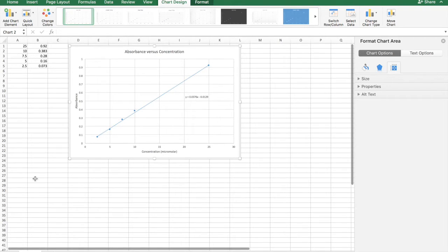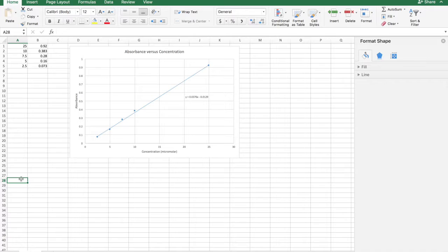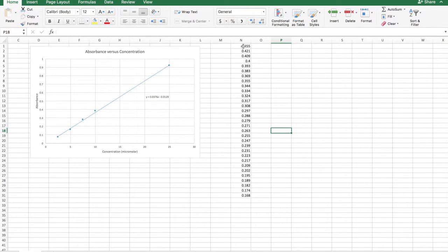All right, at this point in the lab, you then created your reaction. You added 4 mLs of your crystal violet solution and 4 mLs of your hydroxide, and then you measured the change in concentration every 20 seconds. So I've now pasted all of my absorbances for the 10 minutes that I recorded it myself. These are the absorbances that I got. And I'm going to show you a number of shortcuts that you can do in Excel to make your life a lot easier.